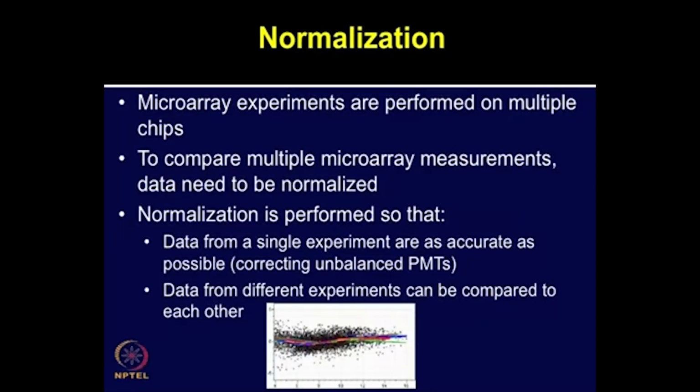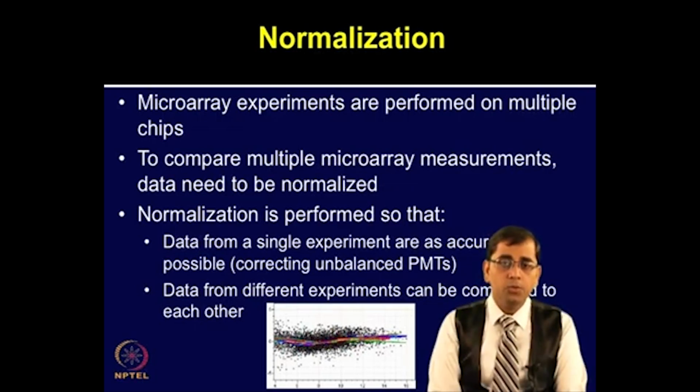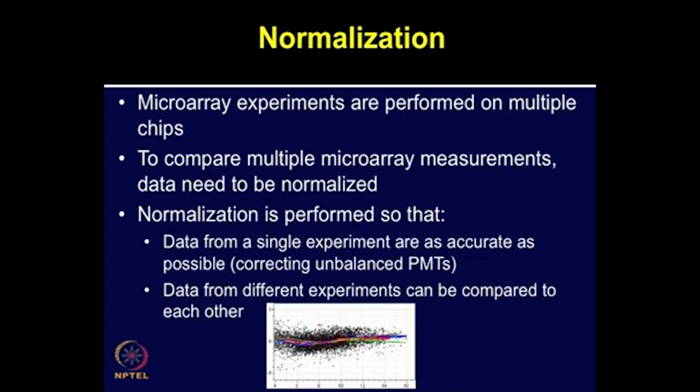Normalization. In microarray experiments, there are many variables involved. Normalization is performed for reducing bias resulting from variables like printing related issues, dye bias or day to day variations. Some commonly used algorithms for normalization are quantile normalization, variance stabilizing normalization, cyclic Loess and robust linear model normalization. Normalized data can be used for comparative analysis so as to ensure that comparisons are unbiased.